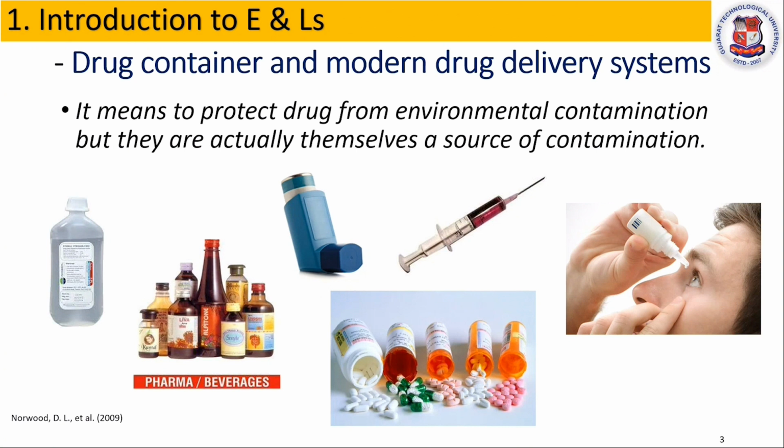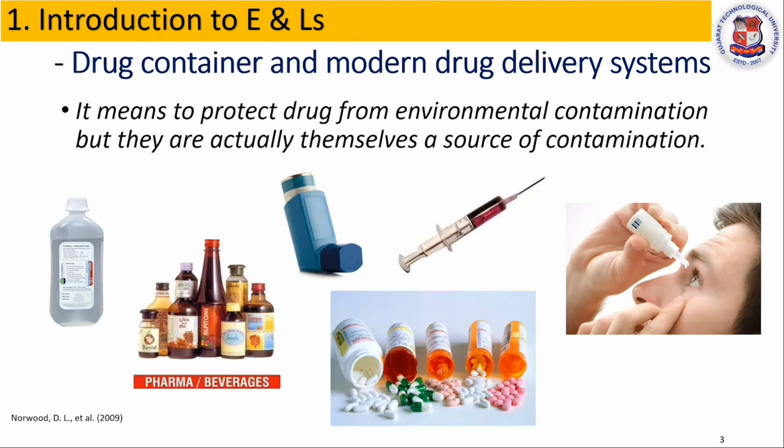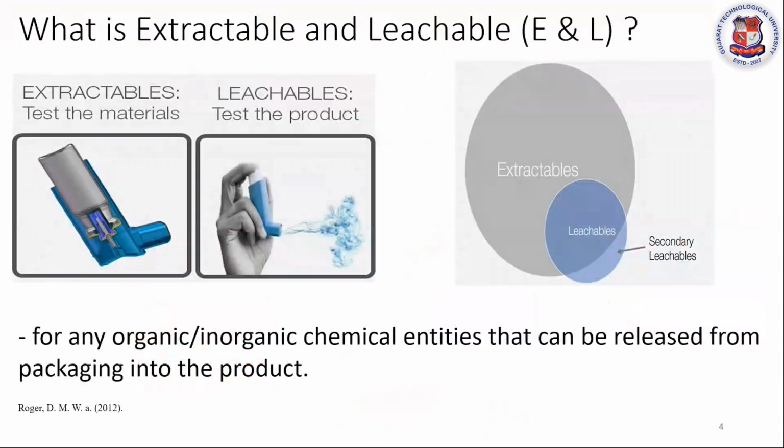Many pharmaceutical preparations are packed in plastic containers, and the plasticizers that are used to make the plastic are freely bound to the container. This freely bound component can be easily leached into the product and then it will contaminate the product, and sometimes they are harmful.